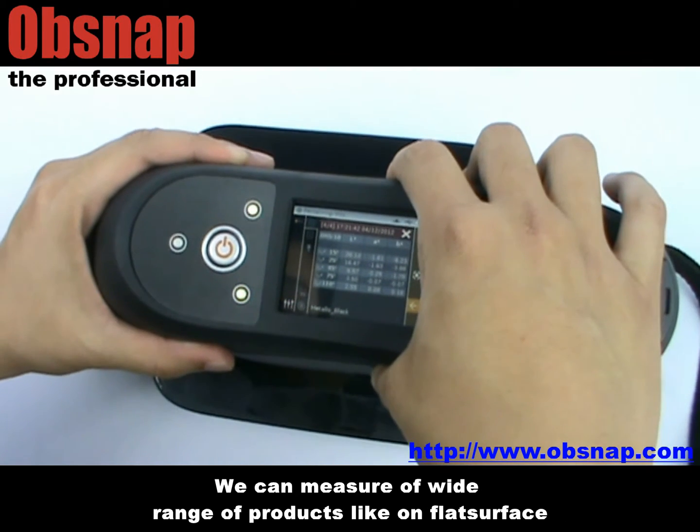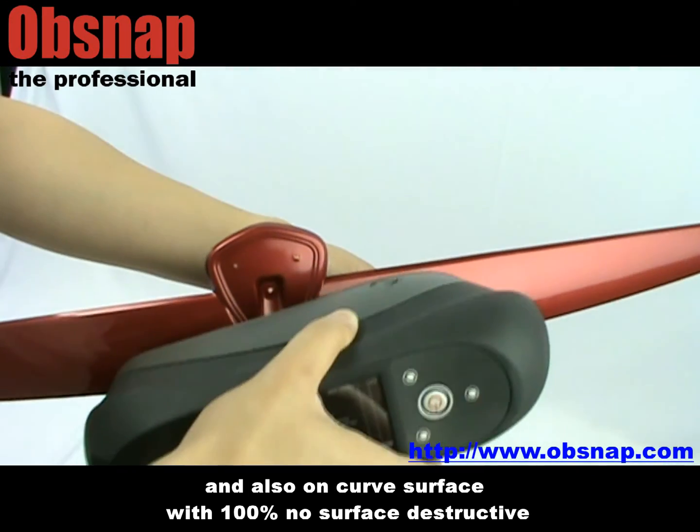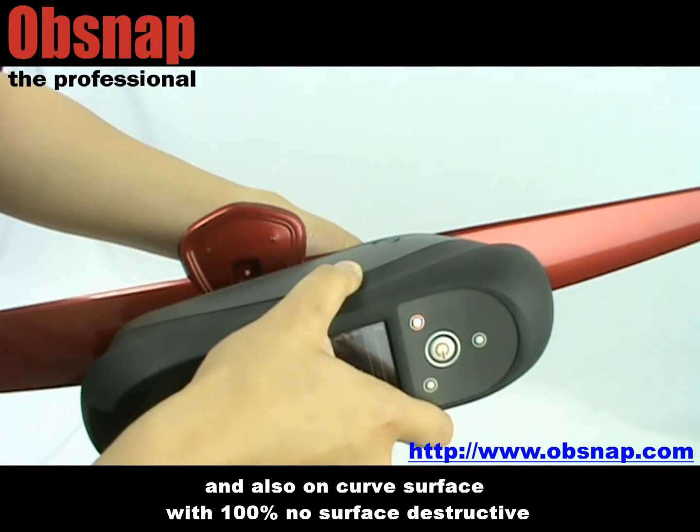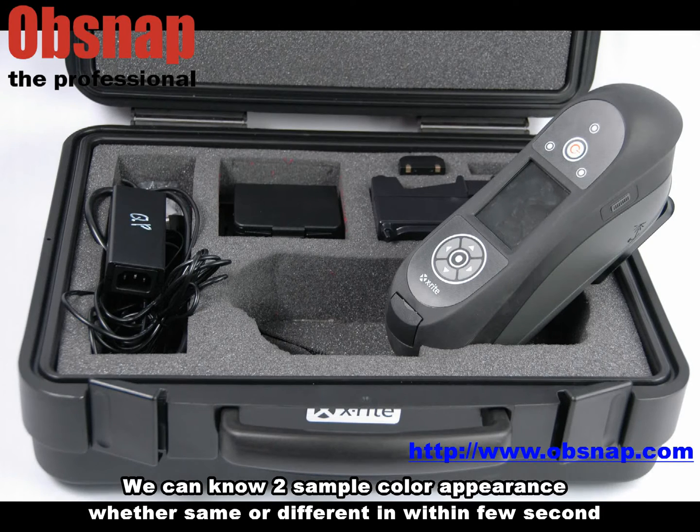We can measure a wide range of products, like on flat surfaces and also on curved surfaces, with 100% no surface destructive. By using this new multi-angle spectrophotometer, we can know two sample color appearances, whether same or different, within a few seconds.